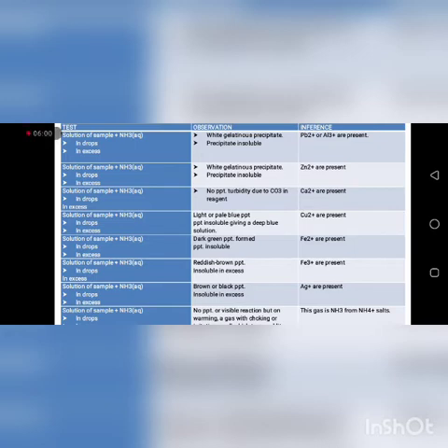So that means that you will be able to rule out zinc, because both lead and aluminum form a gelatinous precipitate which is insoluble in excess aqueous ammonia. The next one: aqueous ammonia is added to the solution of unknown sample in drops, and a white gelatinous precipitate is formed.